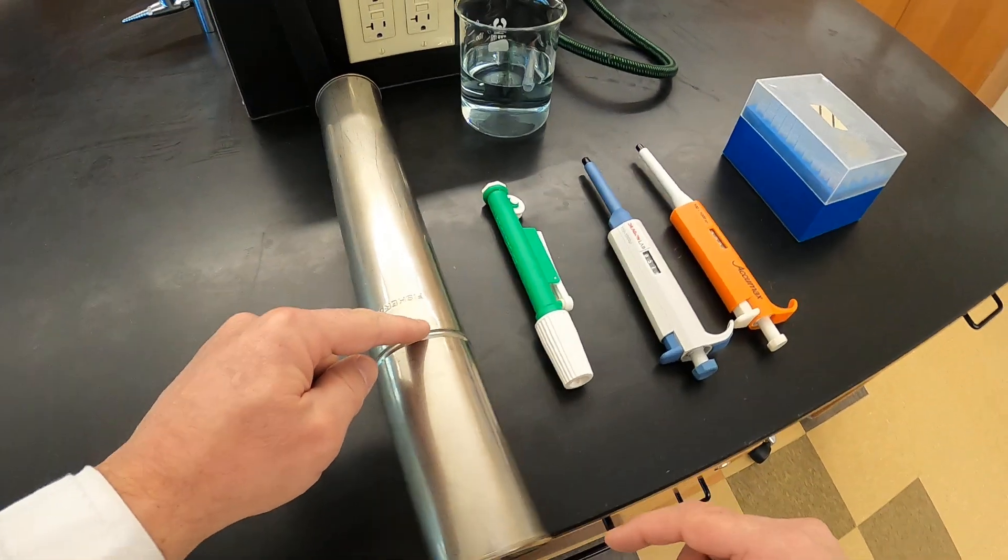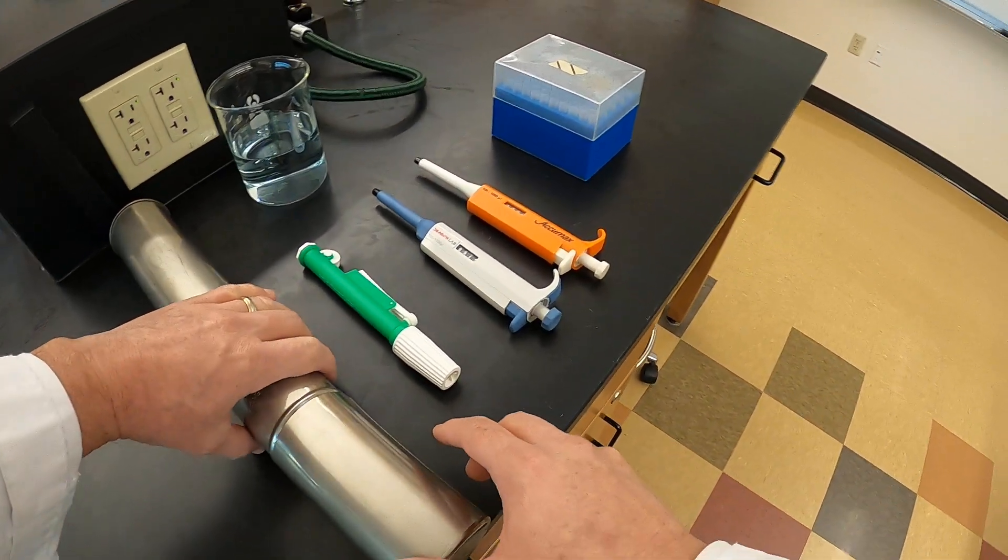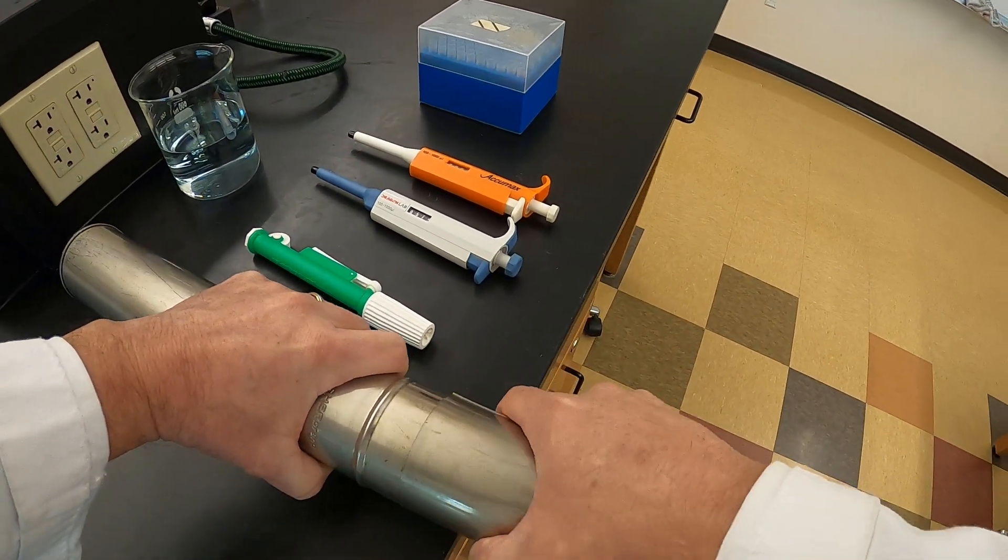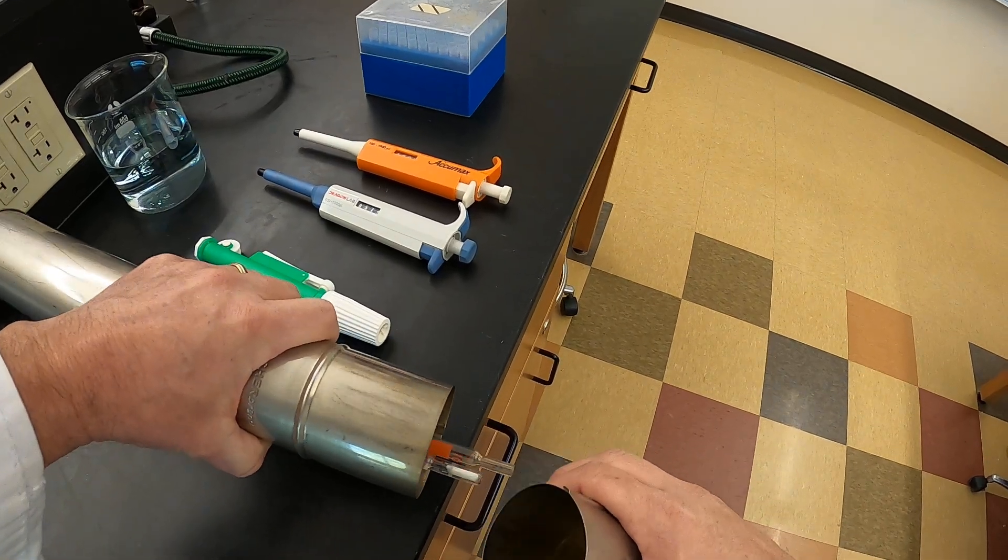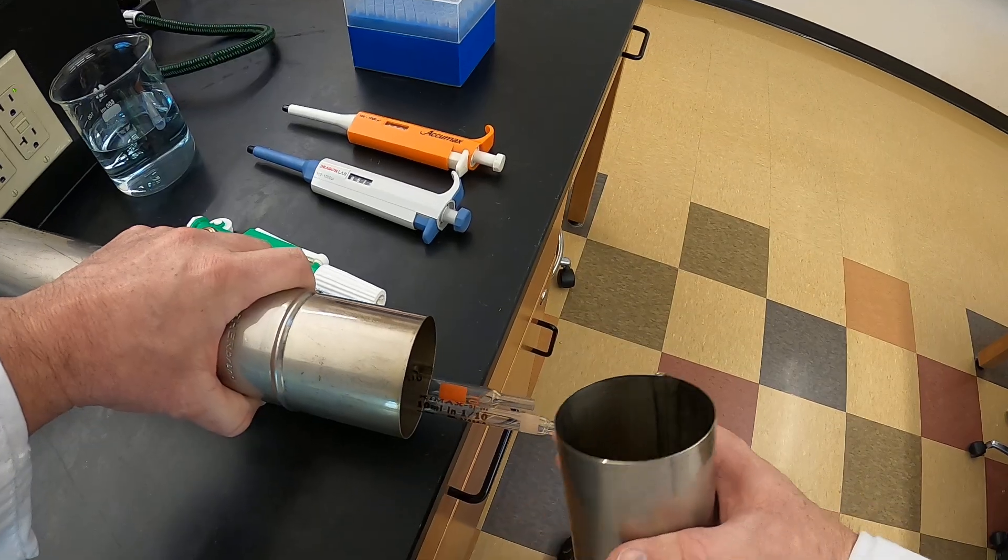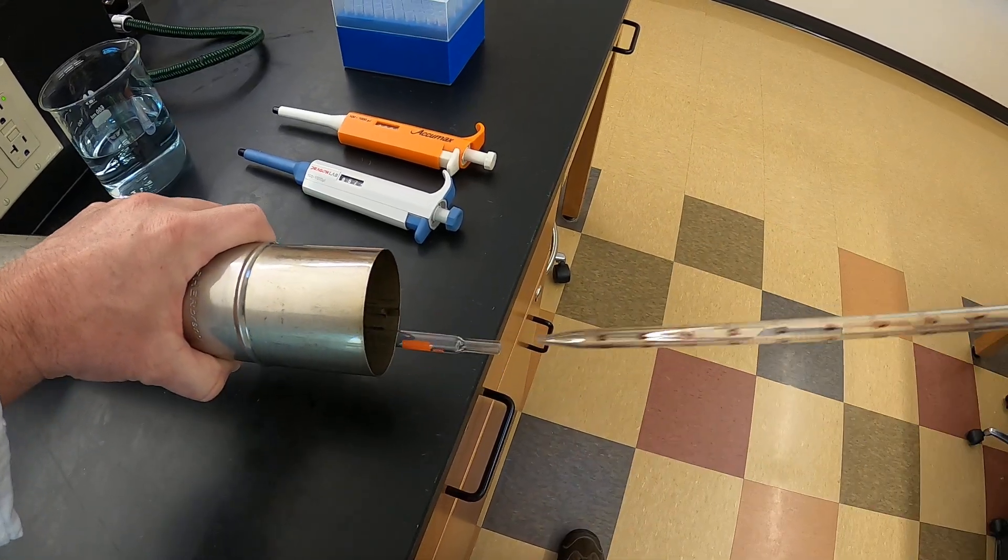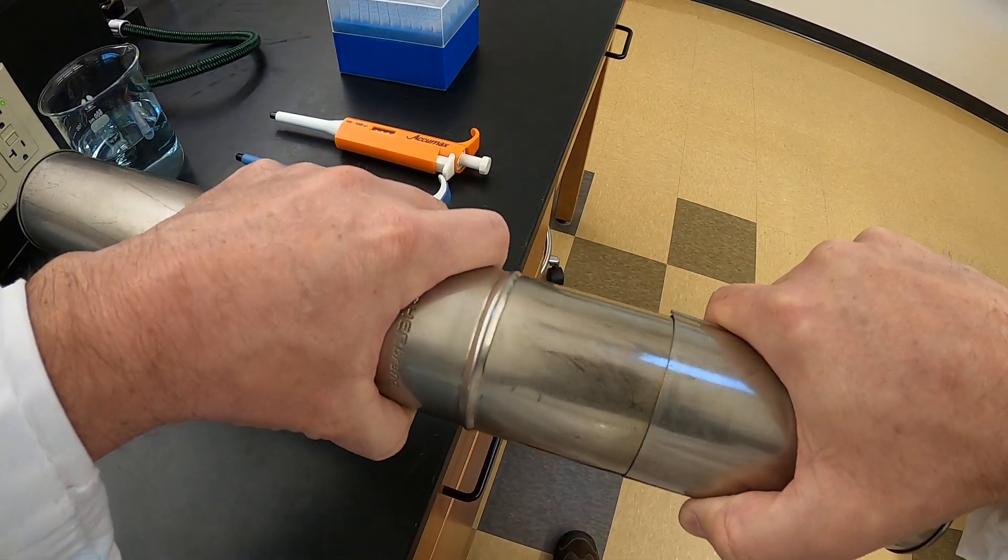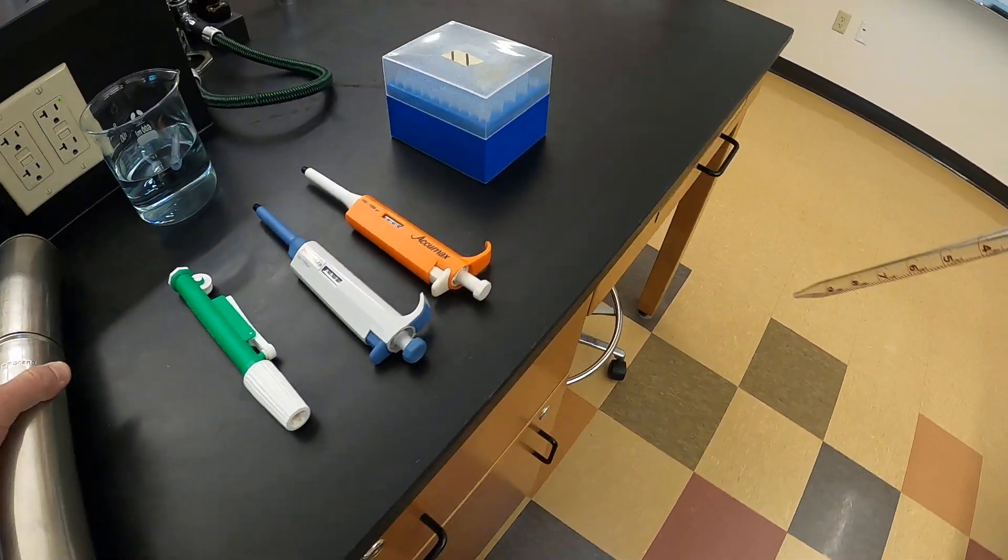We have a lid here, and the easiest way is to take the lid and take it off, and then shake the pipettes out so that they come out a little bit past the edge, and we're able to grab the tip of the pipette. We can put the lid back on and put the tube back.